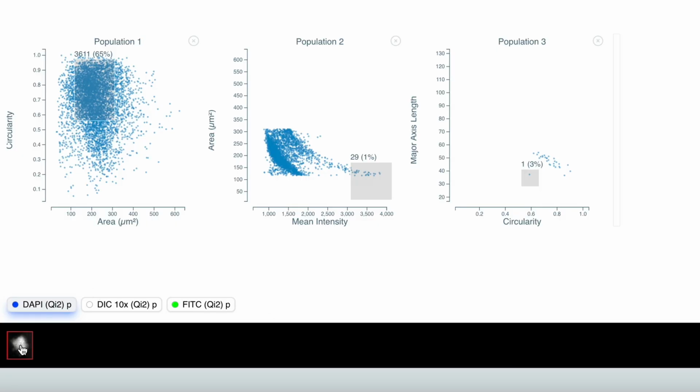The only thing left, I would say, is that when you actually pick a cell, if you have this population, you have the window and a single dot. You maybe want to choose this single dot, and you have a picture of the cell on the bottom. You would like to see exactly this cell in the file. You want to take the raw file of this cell. You still cannot do it personally. You need to look through all the pictures, and if you take 100 pictures, it's very difficult to find as well. But that's just very few things, I would say.